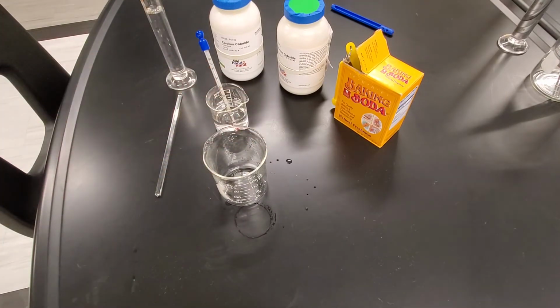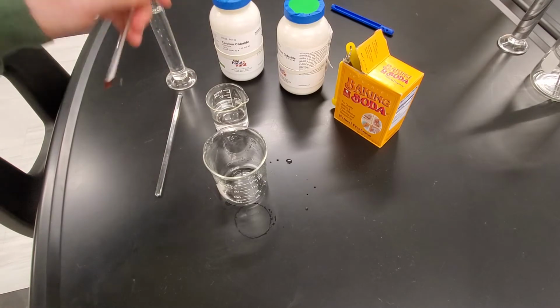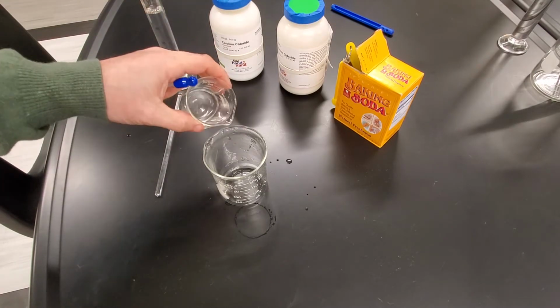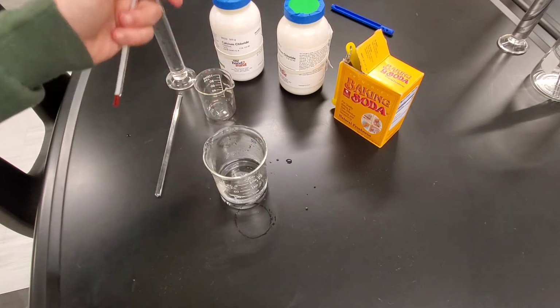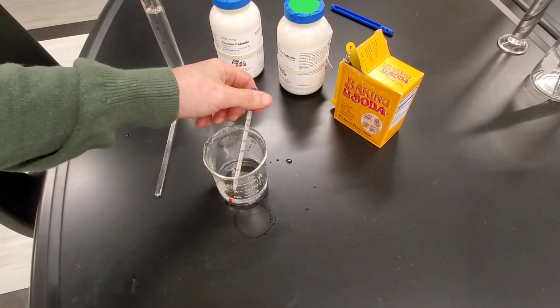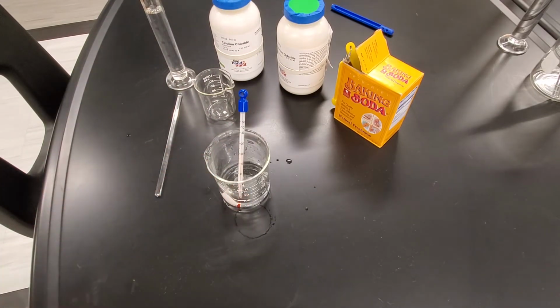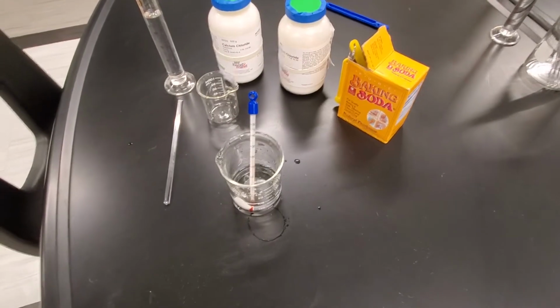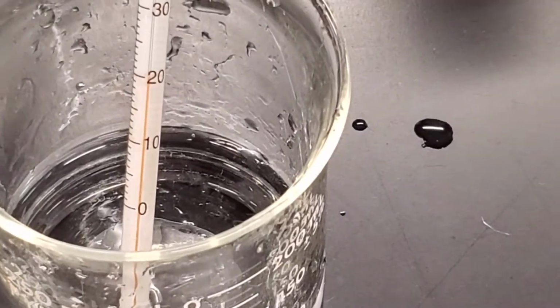As we move on to our next step, we are going to be using a new liquid component and solid component combination. It's still going to be the vinegar, but this time we're going to be mixing it with baking soda. So we add our 50 milliliters of vinegar. We again want to measure the temperature, but we always have to give it 1 minute for the temperature change to take a proper reading. So while we're waiting on that 1 minute, I'll go ahead and zoom back into the thermometer so that you can take the temperature reading yourself.